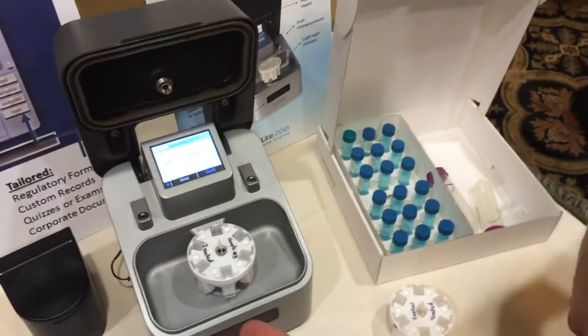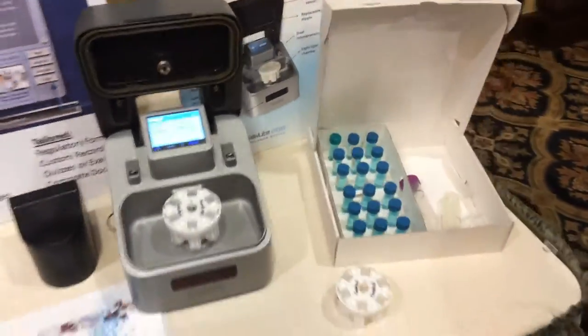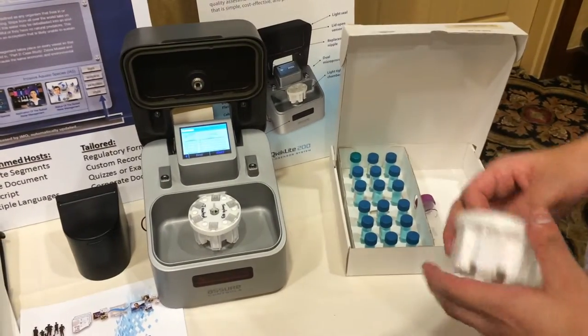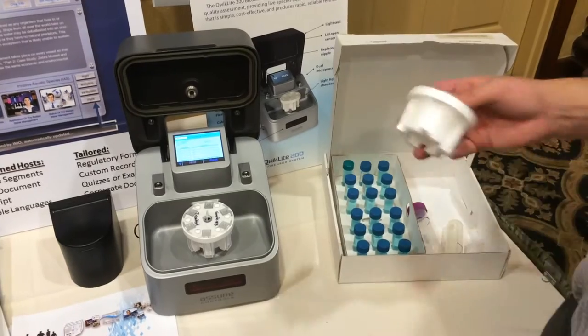At four hours you can put it in the machine and get your results compared against the control. You can do it at four hours, save the same unit, and do it again at 24. When you have a 50% drop in light output compared against the control, that's when you know you have a problem.